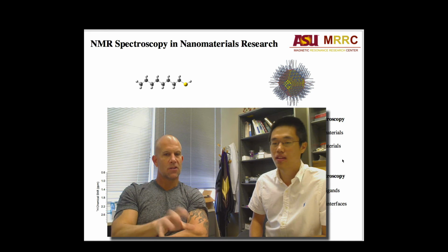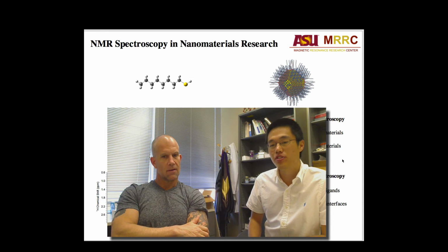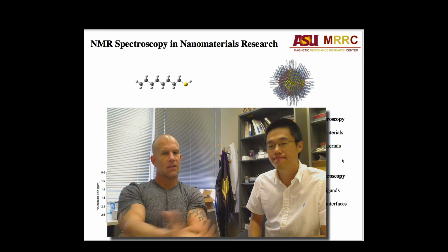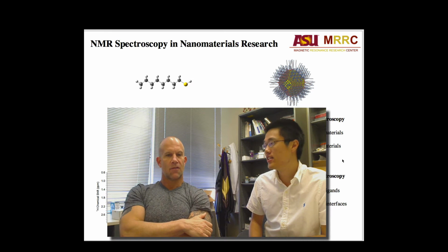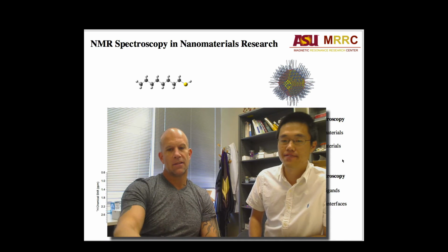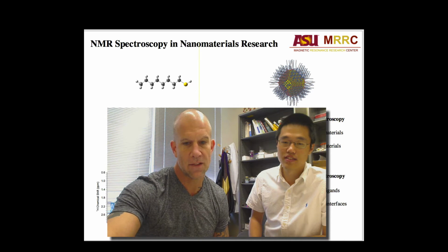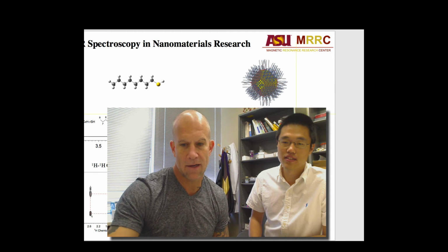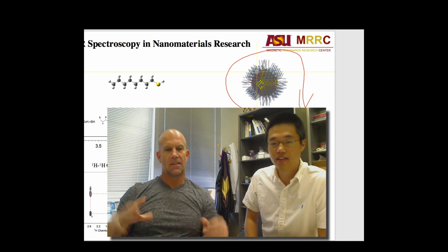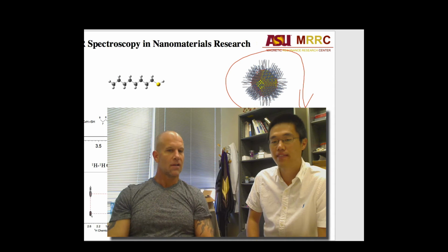Since there's not a dimension on that, is that? It's about 1.5 to 2 nanometers. So on the small side. Yes. But even then, it has quite a lot of surface coverage on it, and it's how these molecules bind on the surface here. Do they bind to different faces differently? How heterogeneous or homogeneous is the binding? That's what we would like to find out.